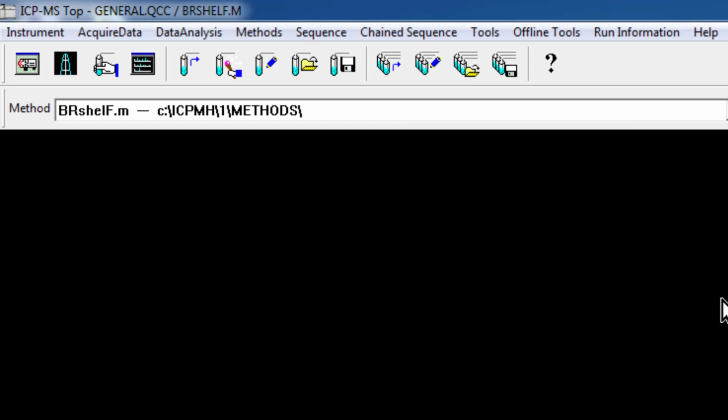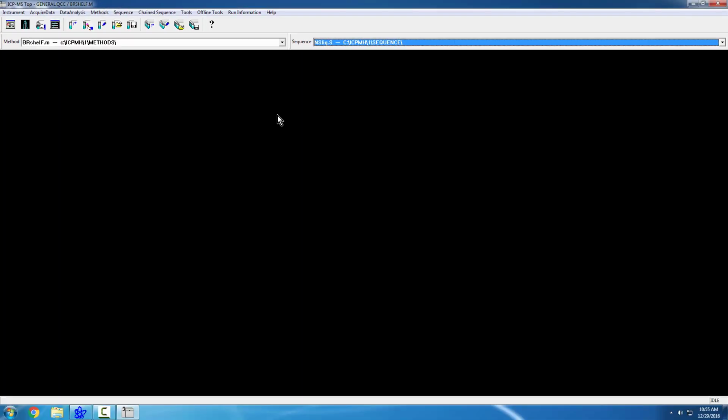There's nothing special in this video besides going over the configuration file and the tune file, and getting myself used to doing these types of videos.